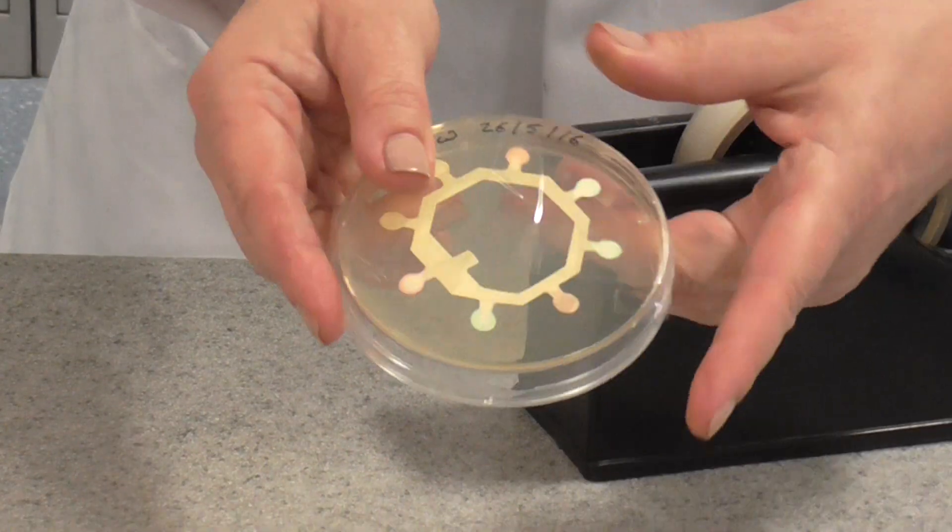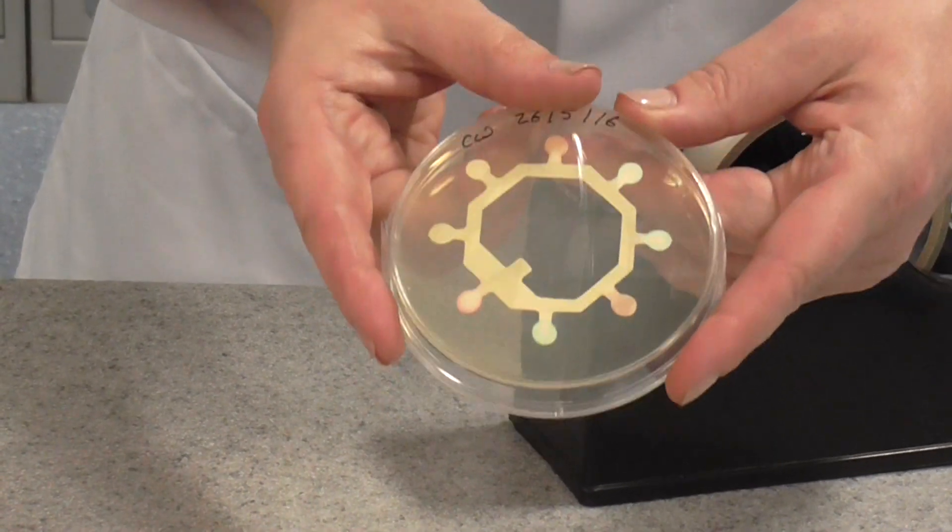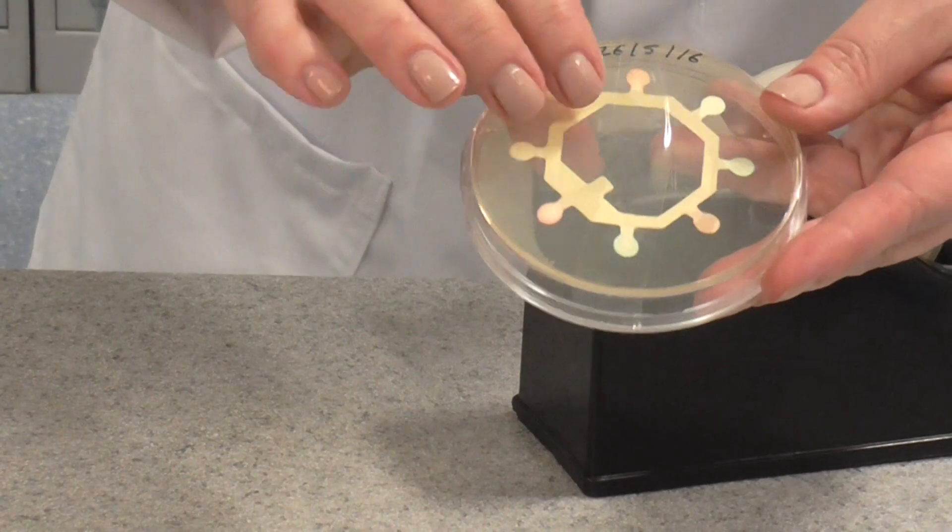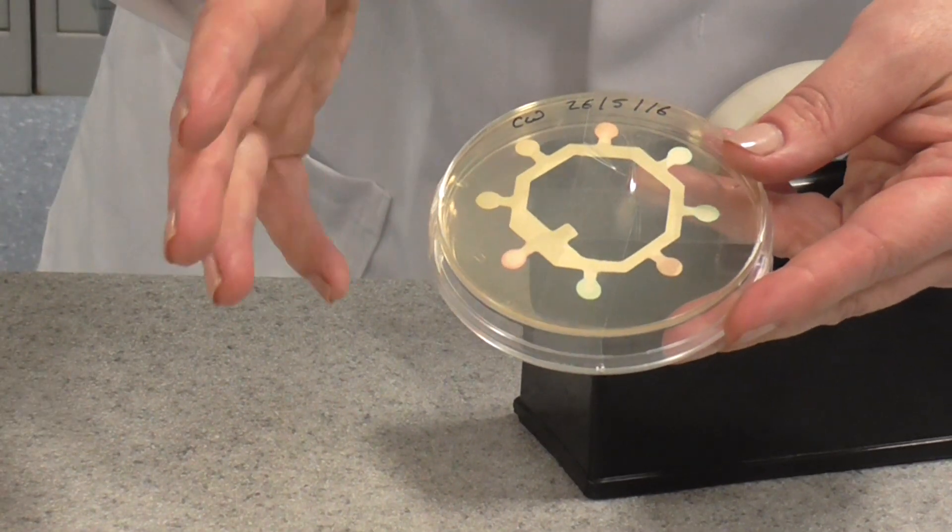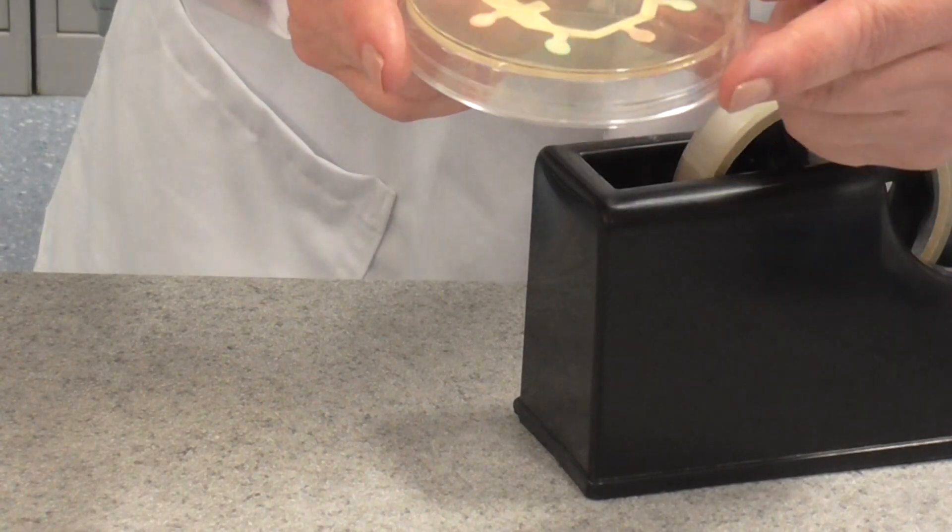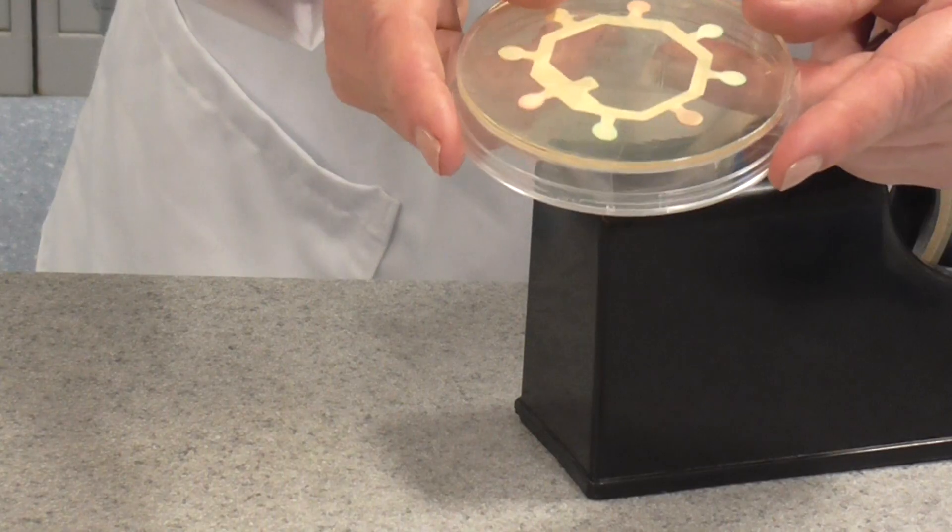This should be placed in an incubator at 20 degrees C in the school lab because we don't use higher temperatures because we do not want to encourage the growth of pathogens. So temperatures around 37 degrees are not allowed. So 20 degrees C for about 48 hours and you should be able to see the results.